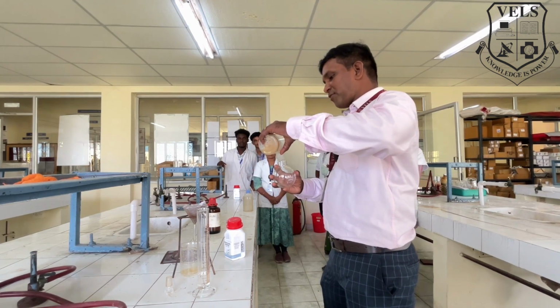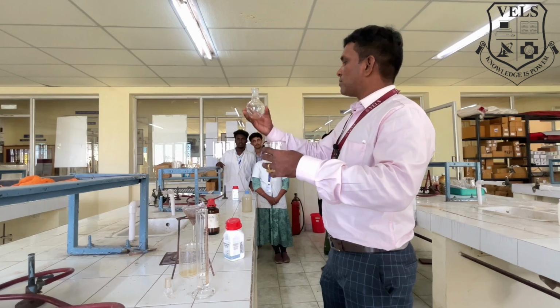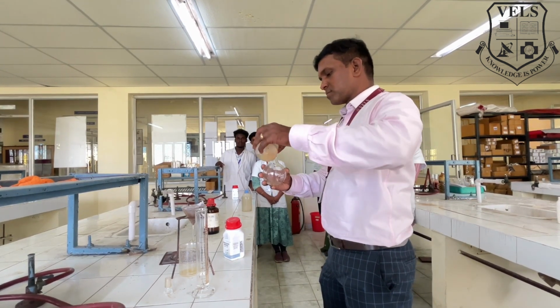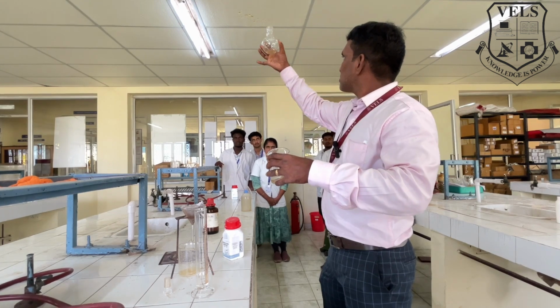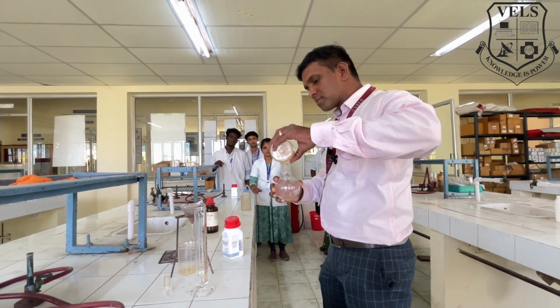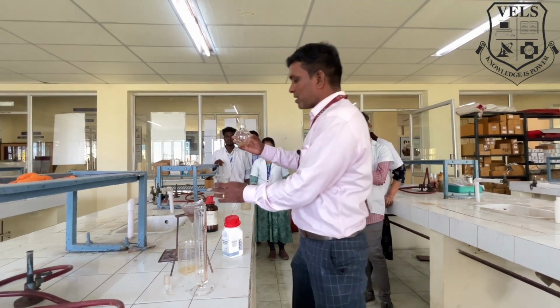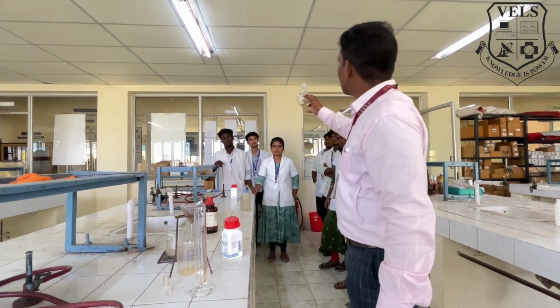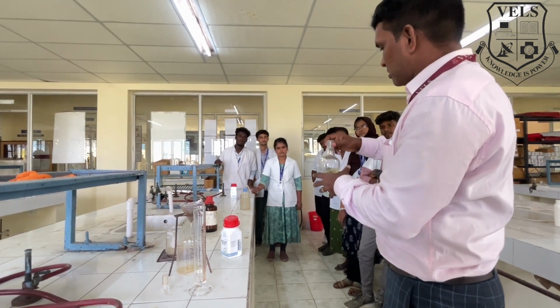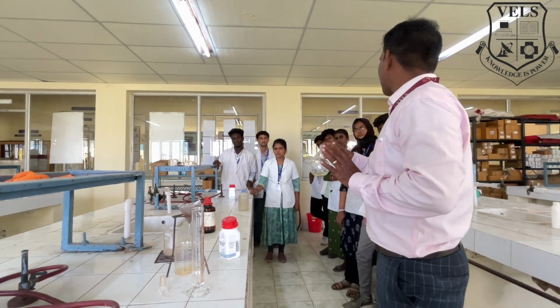Decant this solution carefully. Now I have the pure chloroform extract. Evaporate this and you will get the compound caffeine.